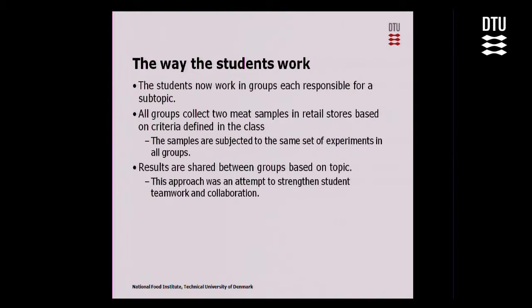So they collect these samples, and the criteria for collecting the samples they have defined in class. The samples are subjected to the same set of experiments in all groups, as I said, and the results are shared between the groups. And that means they have a subtopic, which means, for example, they have to collect the background data of all the meat samples they have collected.